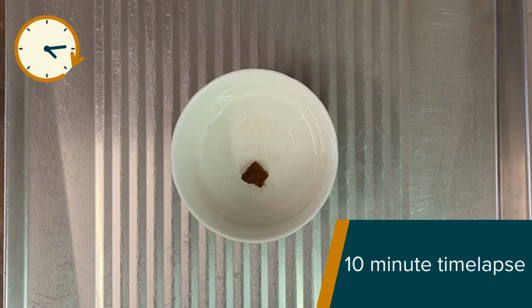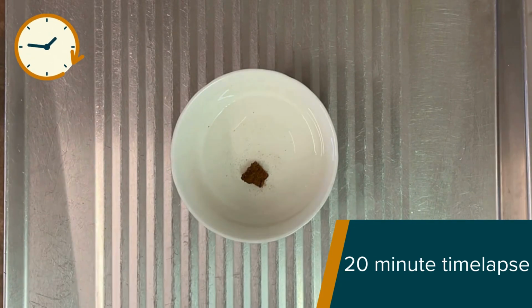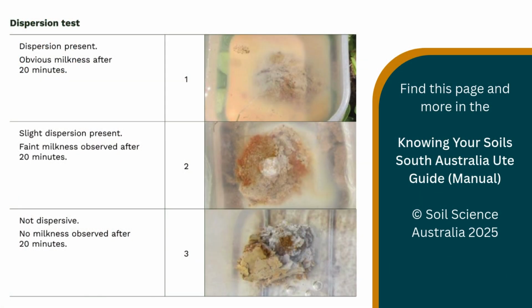Next up, keep it going for another 10 minutes. So we're at 20 minutes total. Then we can check for dispersion. It's now been 20 minutes and we can't see any milkiness or cloudiness. So it's a no for dispersion for this sample.